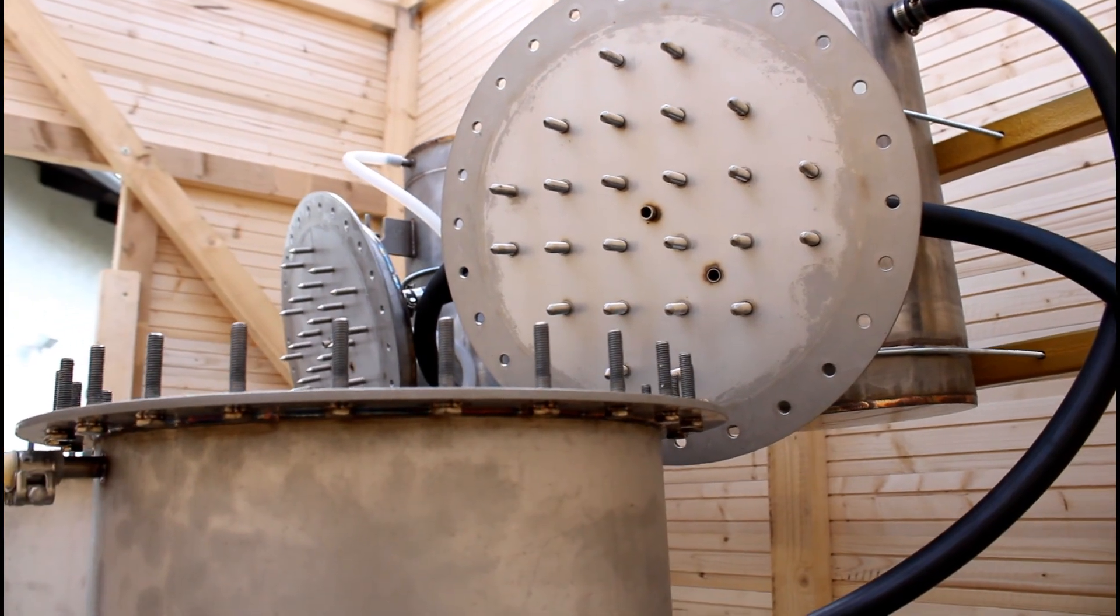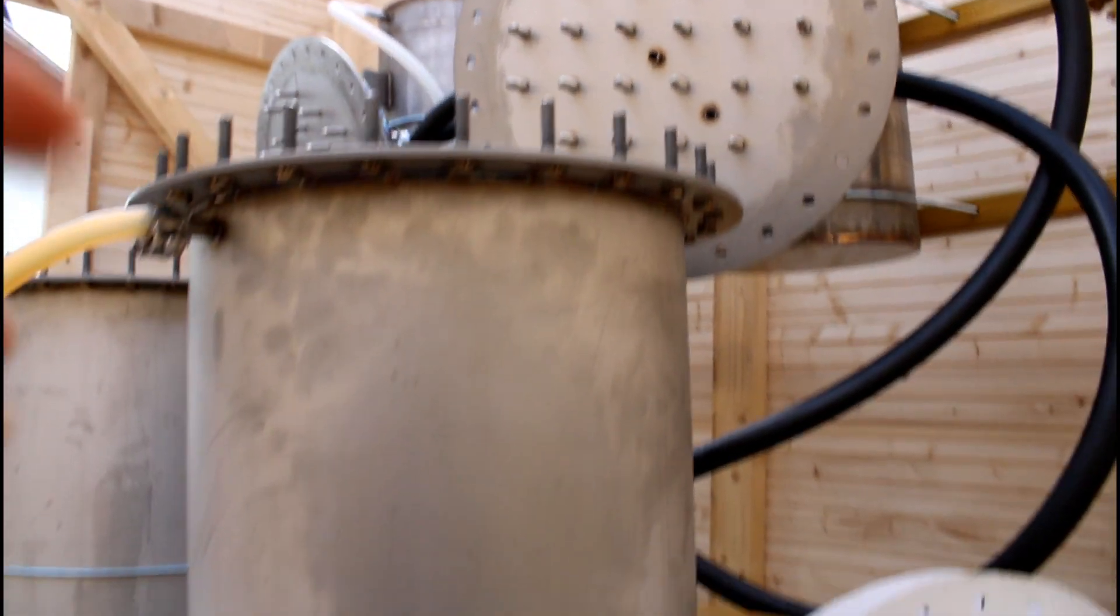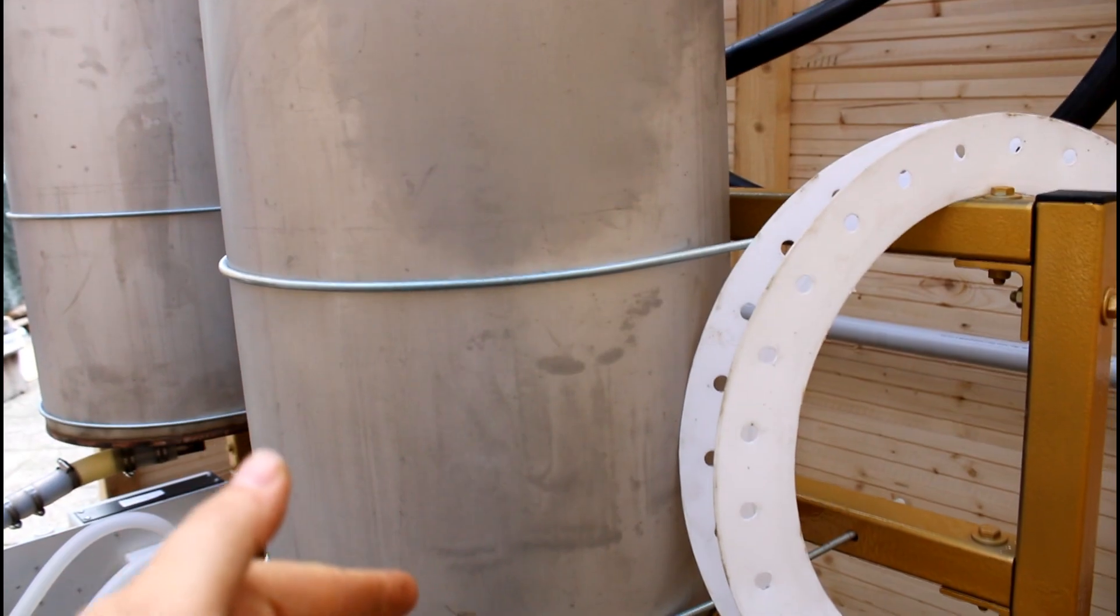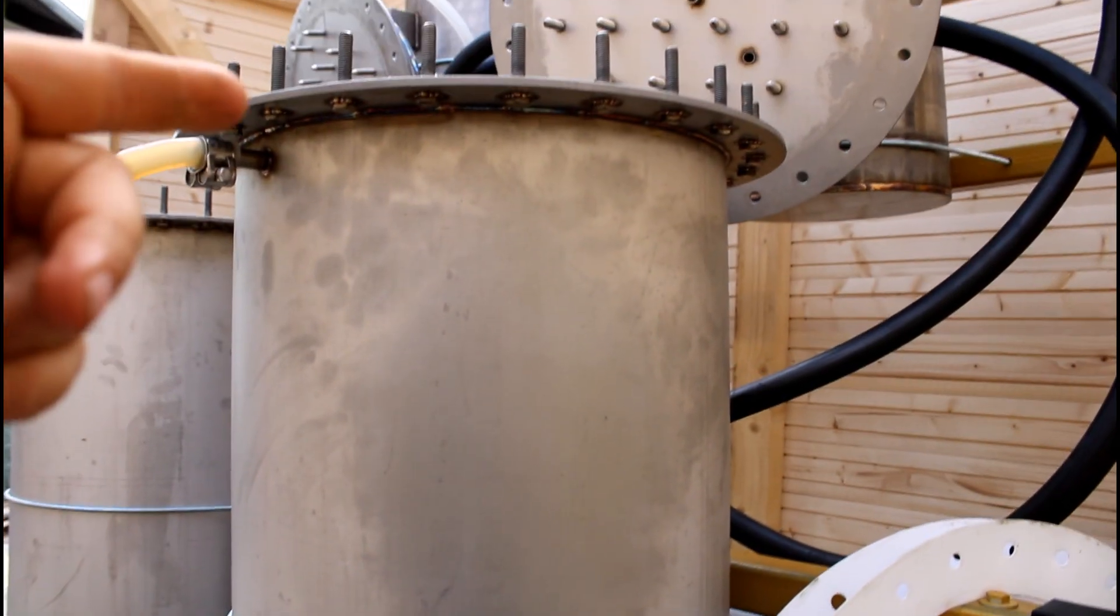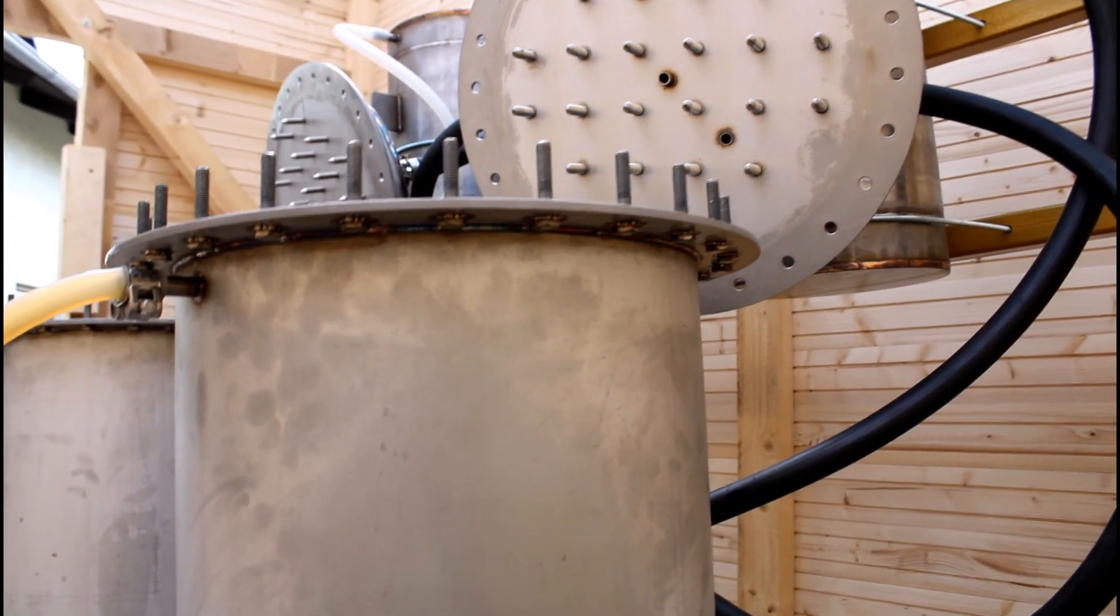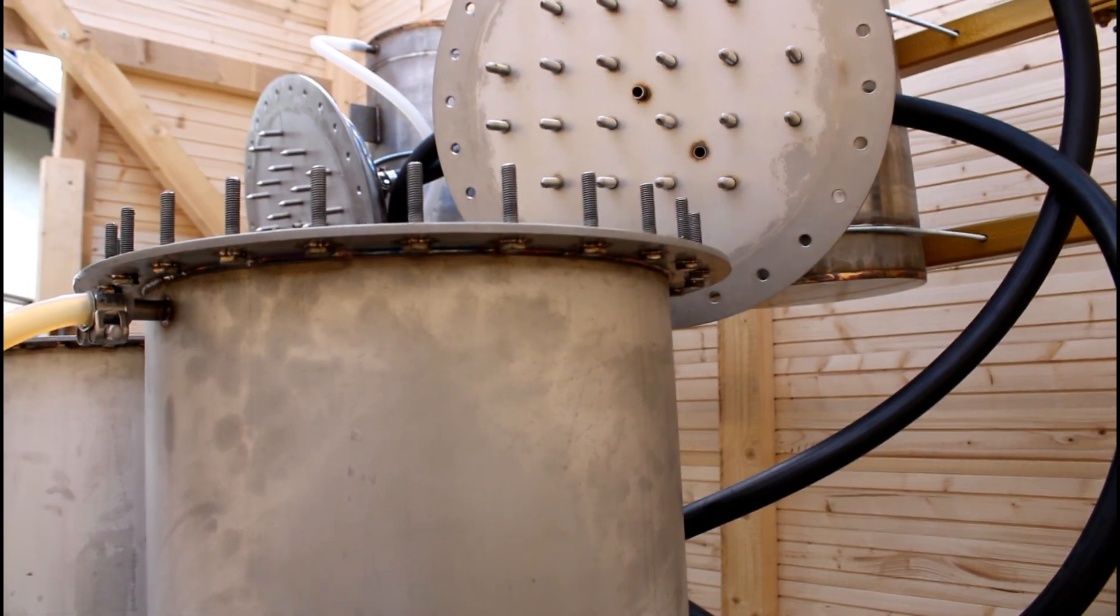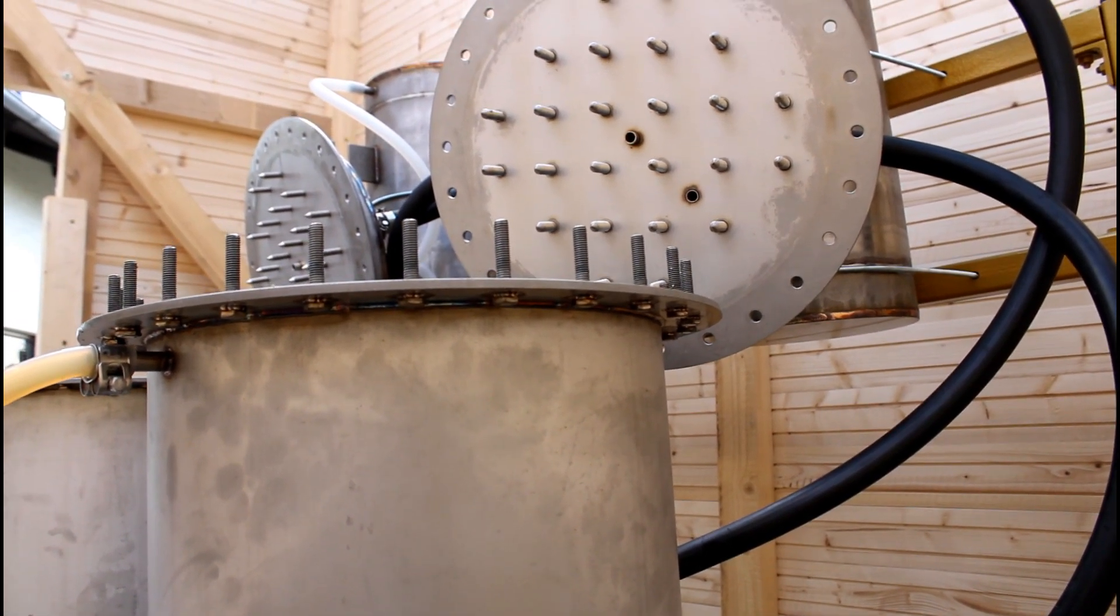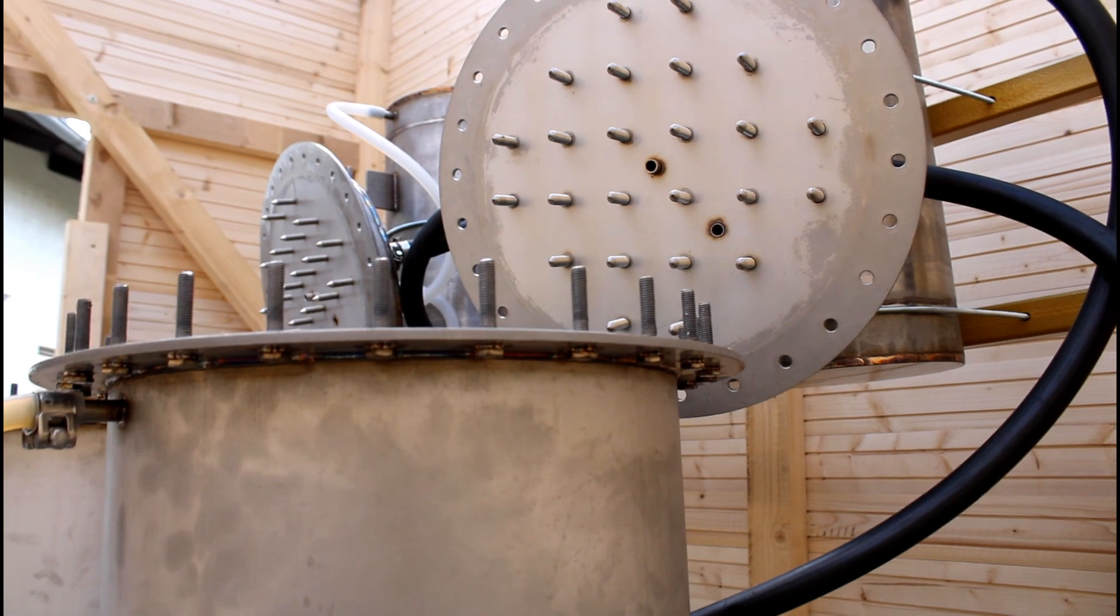Let's have a look here on the second stage. So as I already told, this kind of tubes here will hold the actual herbal matter up to 10 kilos depending on the volume and on the weight of the herb.